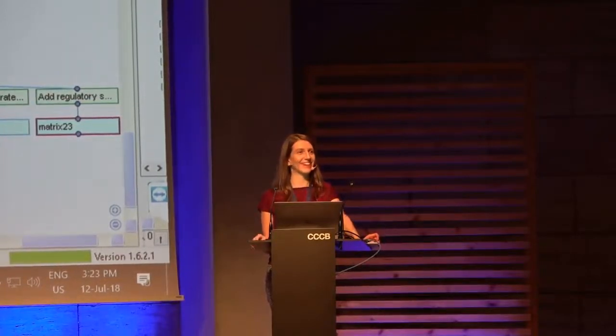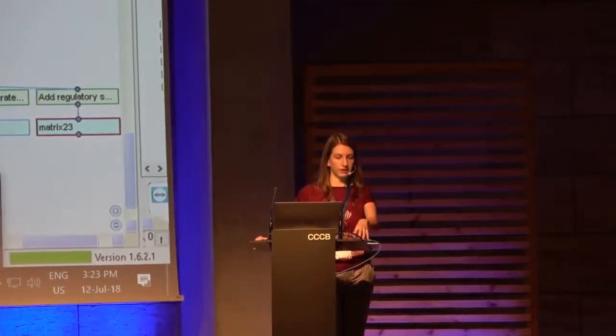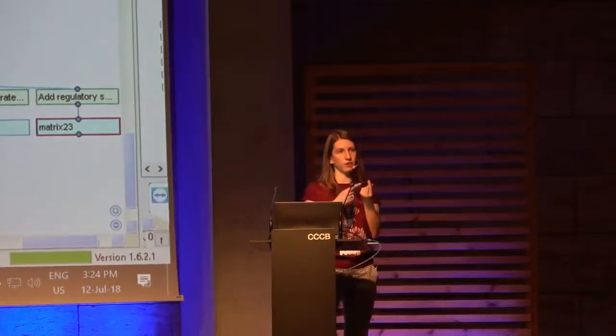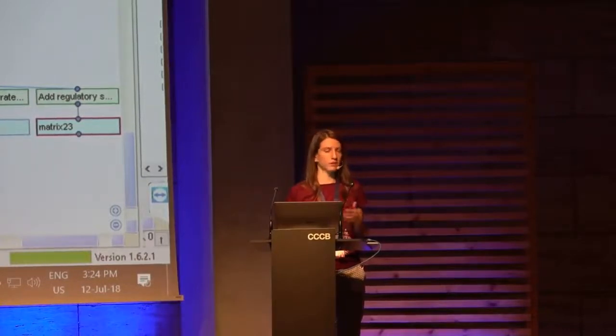I have a question about the multiplicity column. How was it used in the statistical testing, or can we use it for later analysis for specific results for 1, 2, or multi-phosphorylated peptides? We essentially decided that each of these different quantifications will be kept as a separate event, so everything was tested separately. Because of this idea that maybe if you see just one modification on the peptide, it has one function, but when there are 2 sites, it plays a different role. So we just kept them as separate events. Okay, so when you did the clustering based on the rows, in one cluster there can be a mix of 1 time, 2 times, 3 times, and so on. It is possible, yes, though if you inspect your data carefully, you'll see that these are not so many cases. Okay, thanks.